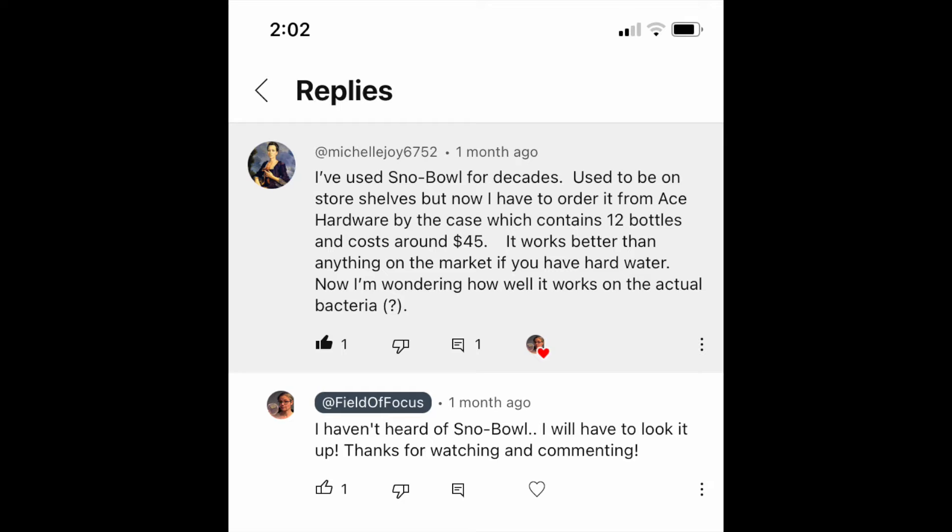Michelle says she's used Snowbowl for decades. It used to be on store shelves but now she has to order it from Ace Hardware by the case, which contains 12 bottles and costs about $45. It works better than anything on the market if you have hard water. Now she's wondering how well it works on the actual bacteria. So Michelle, we're going to find out today.